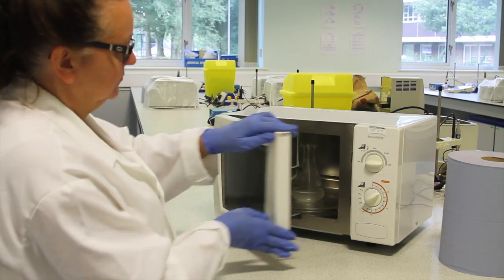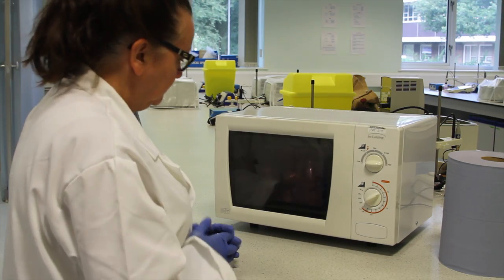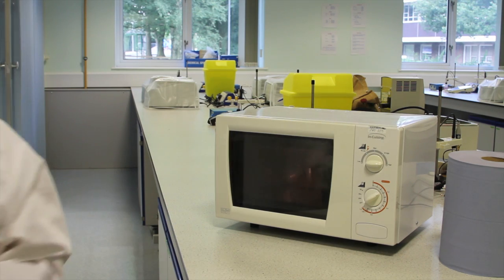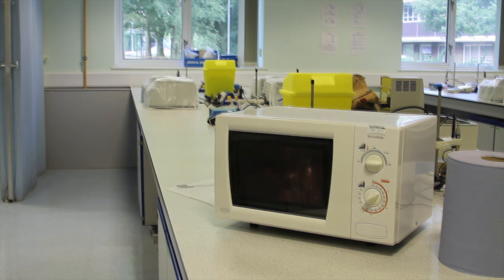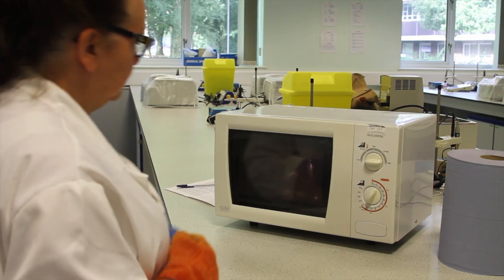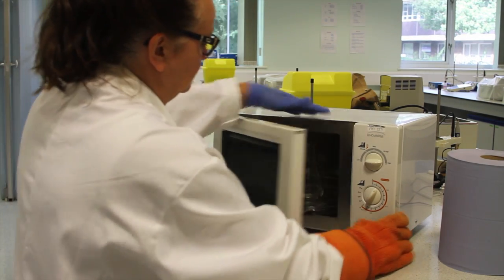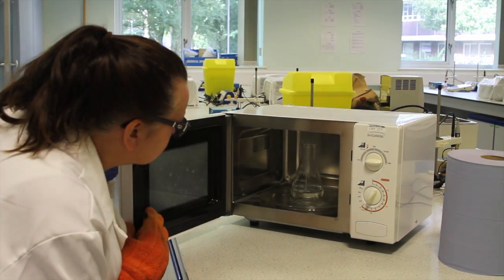Once the agarose is dissolved in the buffer, it needs to be allowed to cool to about 60 degrees before it is poured. Pouring it while it is too hot may cause the gel cast to buckle. Cool it too far and the gel will set in the flask.